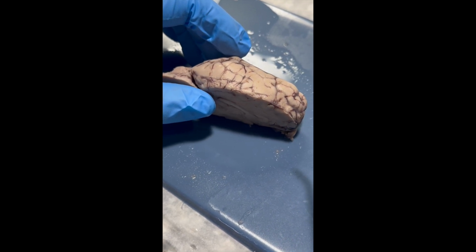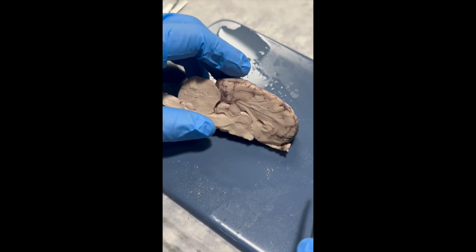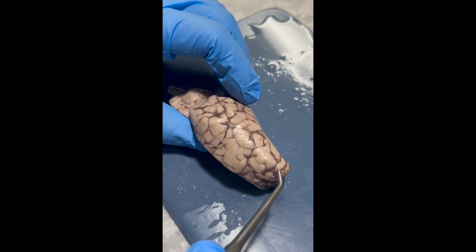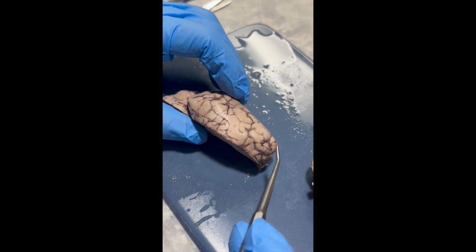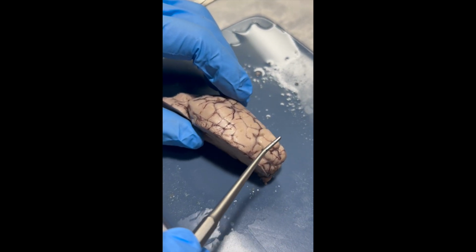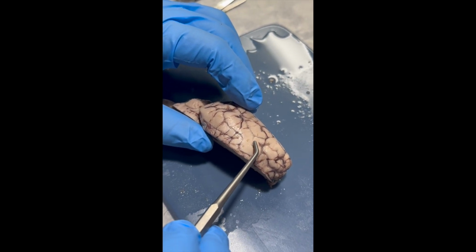Now, moving from the outside of the brain, we're going to look more at the inside. So the cerebrum is this entire part here. It's the upper part of the brain. There's two hemispheres of it. This is one. There's also one on the other side that we dissected. This is split into a couple different lobes. The frontal lobe starts at the front here and goes to the precentral gyrus. Gyri are these ridges you can see here. Sulci are the folds within the brain.